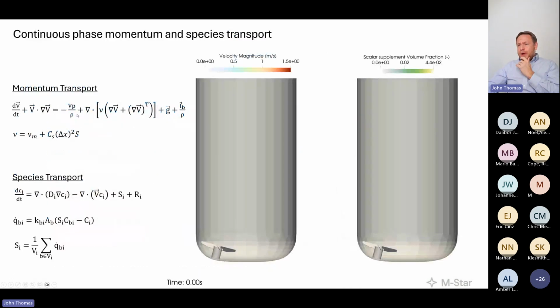And just to speak to this point, a little more caveat. When I say we are solving the Navier-Stokes equations, when I say we're solving the species transport equations, we're not. Nobody is solving these equations. If we were solving these equations, we'd have Nobel Prizes. We'd have Fields Medals. All of us in this space are approximating solutions to these equations. And the means by which we approximate solutions to Navier-Stokes is using the Boltzmann transport equation, which works very well on GPUs. That's why we did that.